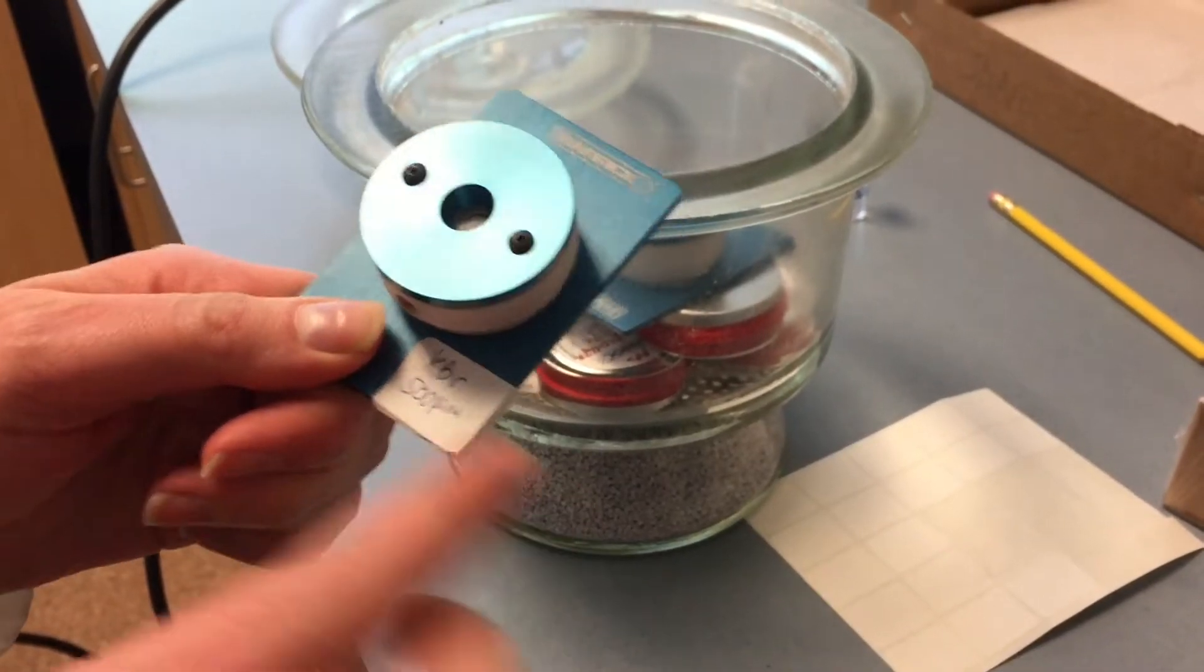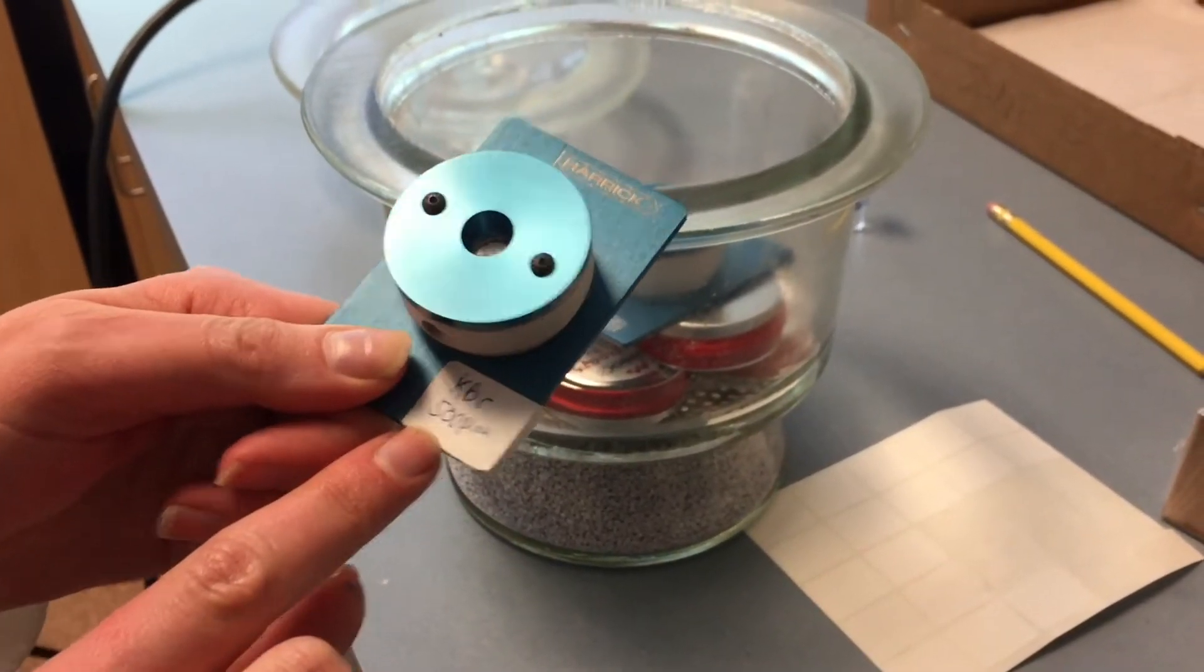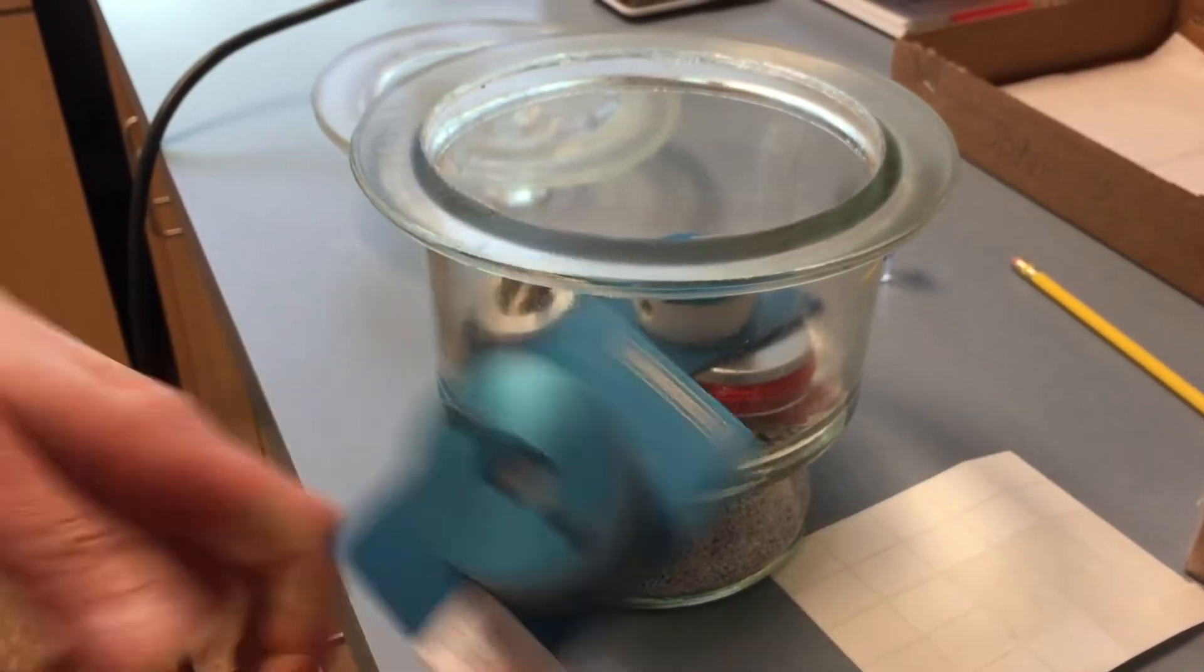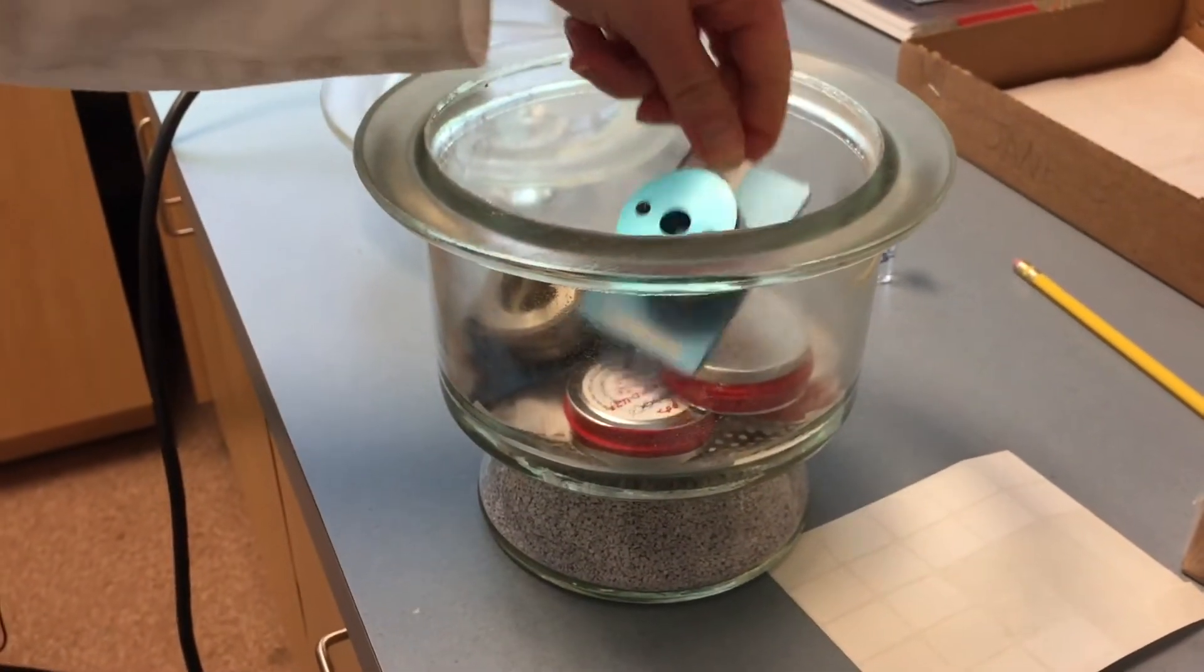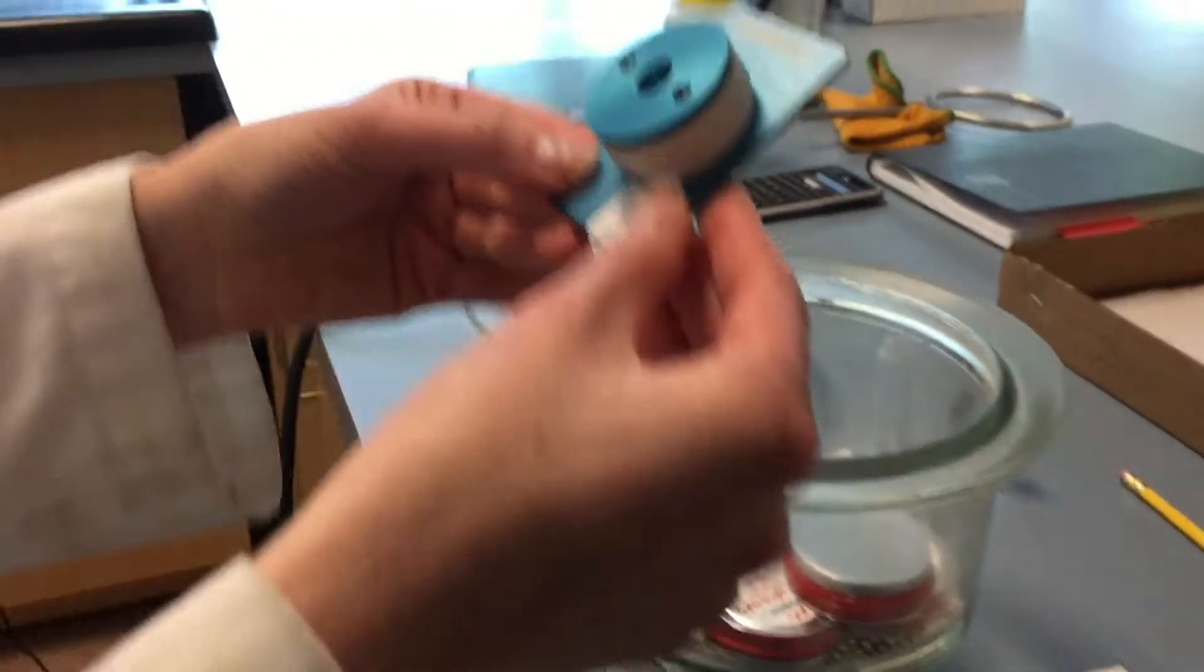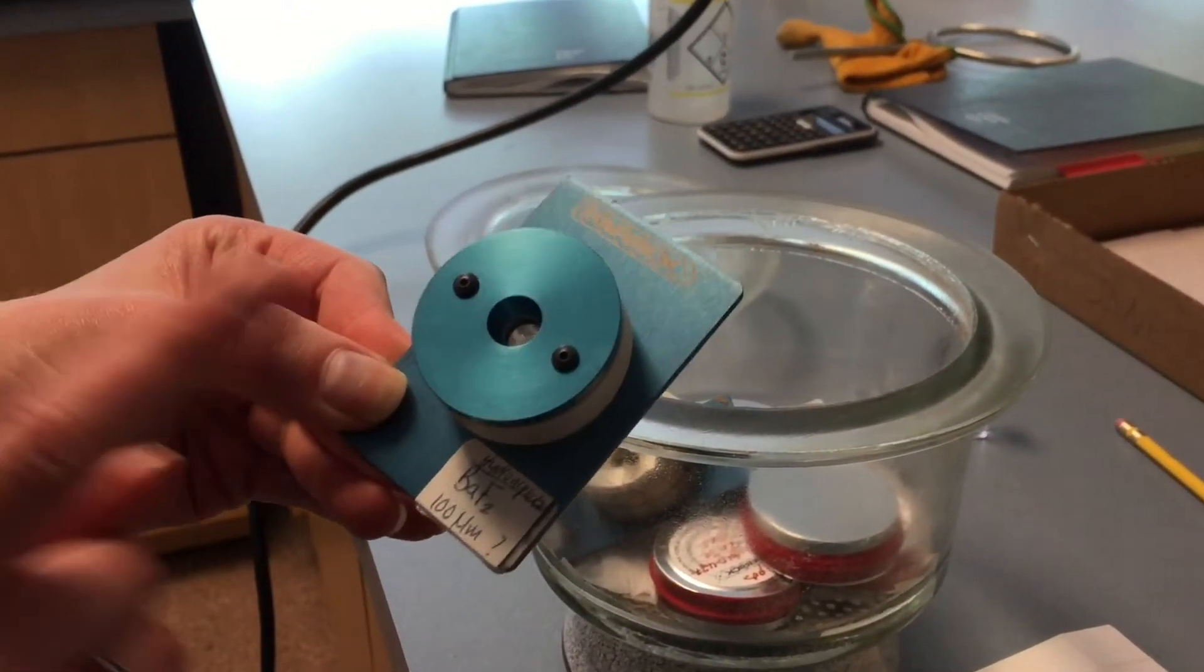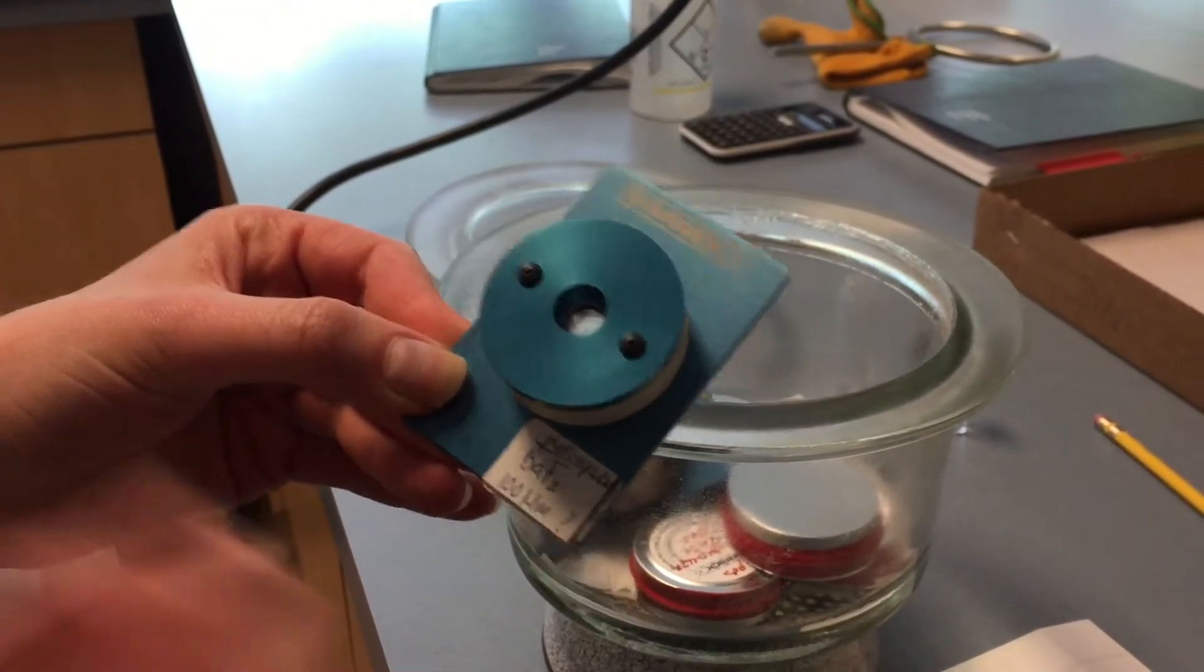The window material here is made out of KBR. Right now the spacing is 500 micrometers. So the space between the two windows is 500 micrometers. That spacing can be changed. This one is barium fluoride and has a spacing of 100 micrometers.